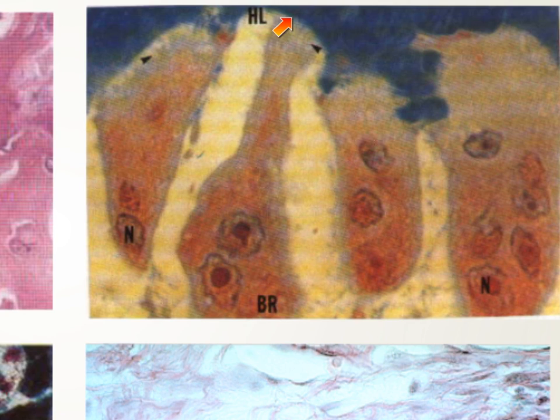At this brush border in the osteoclast, the brush border is the area in which there is a microenvironment of low pH, and lysosomal enzymes are released here so that bone resorption takes place. Accordingly, we have an empty space. Look at this small arrowhead. This empty space due to resorption of the bone is called Howship's lacuna. It is called here Howship's lacuna.